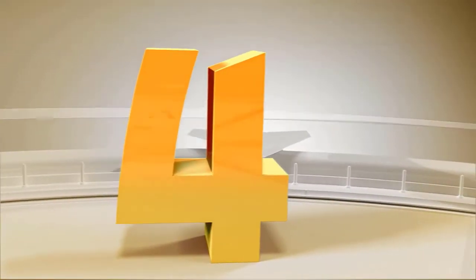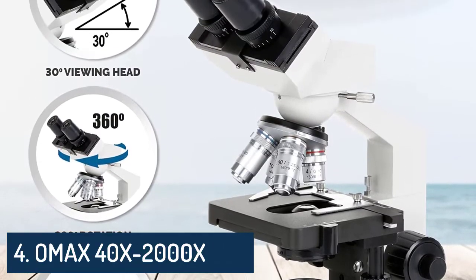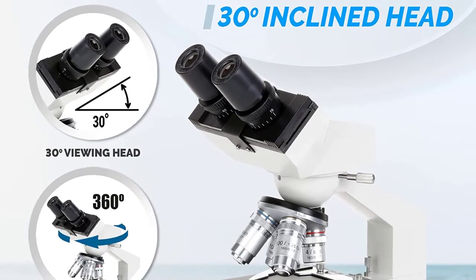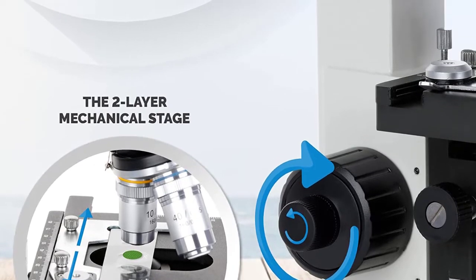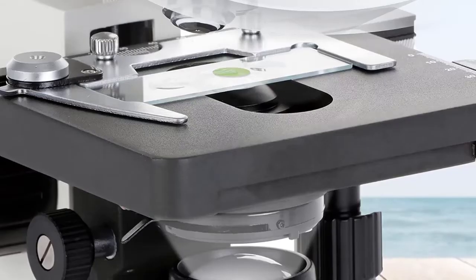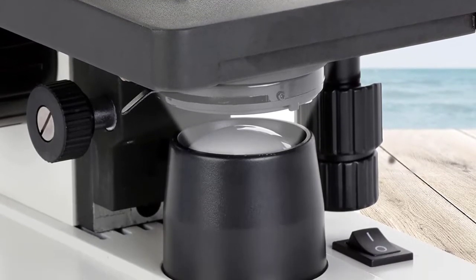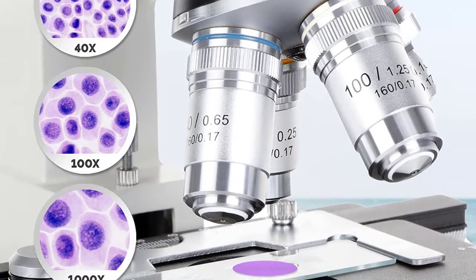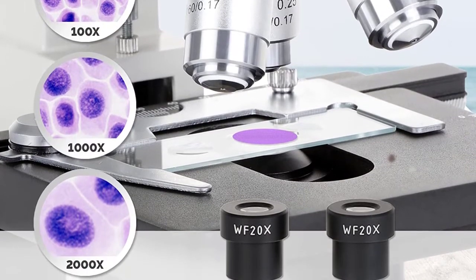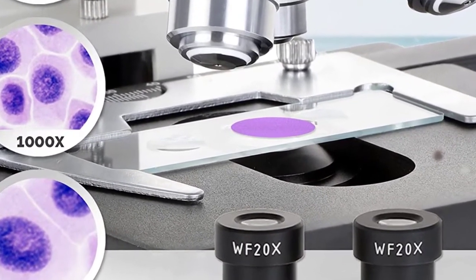Number four: Omax 40x-2000x Lab LED binocular compound microscope with double layer mechanical stage and coaxial coarse/fine focusing knob. Light source type LED, material metal, color silver, white, black. Real angle of view 45 degrees, maximum magnification 2000x, voltage 7.5 volts.